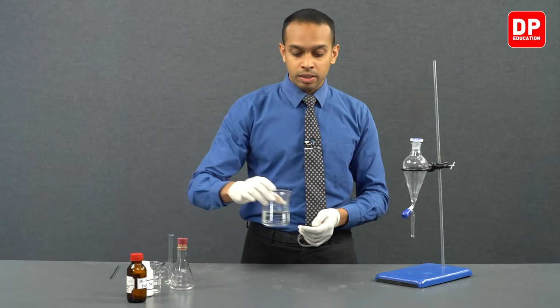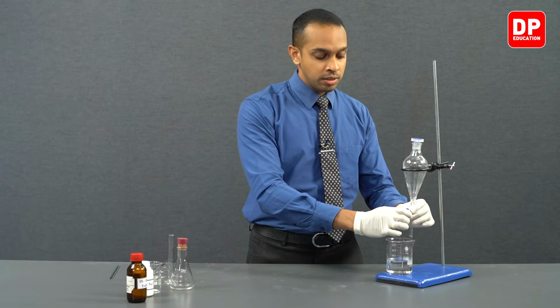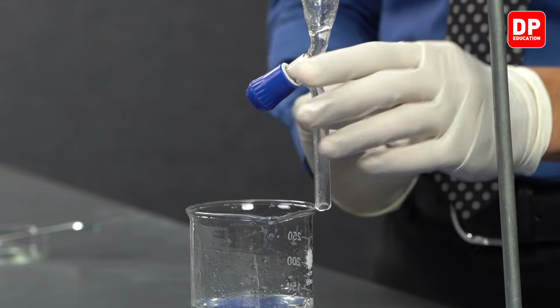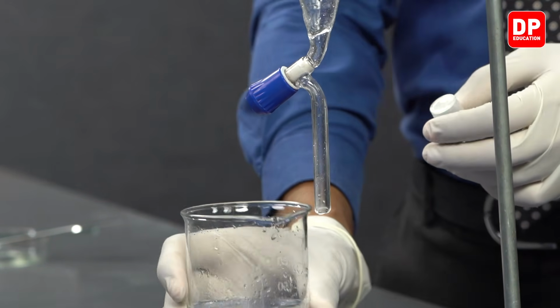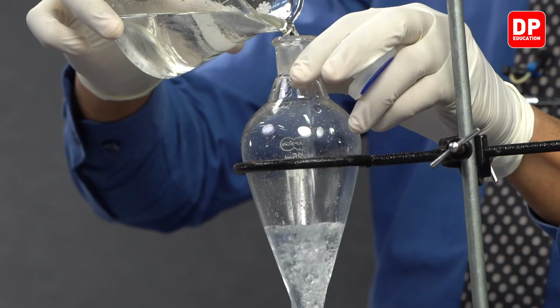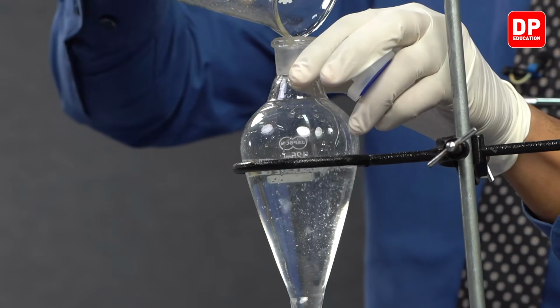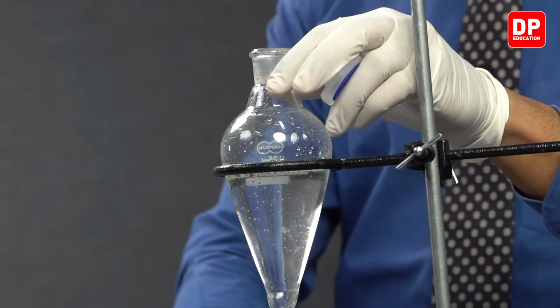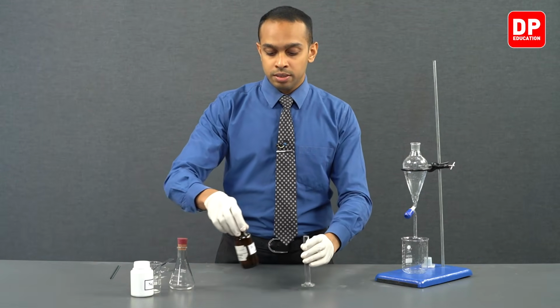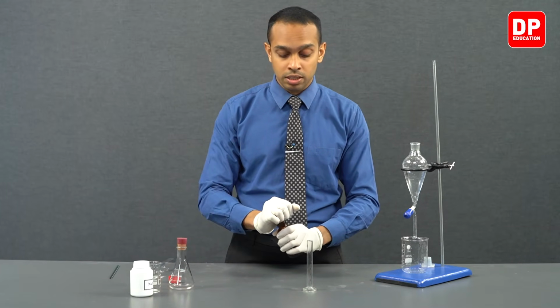So to carry out our third and last solvent extraction, we will again tighten our stopcock in this separating funnel that we have here, and we will transfer this aqueous mixture into our separating funnel, and afterwards we will measure 10 milliliters of diethyl ether like we did in the previous two instances.